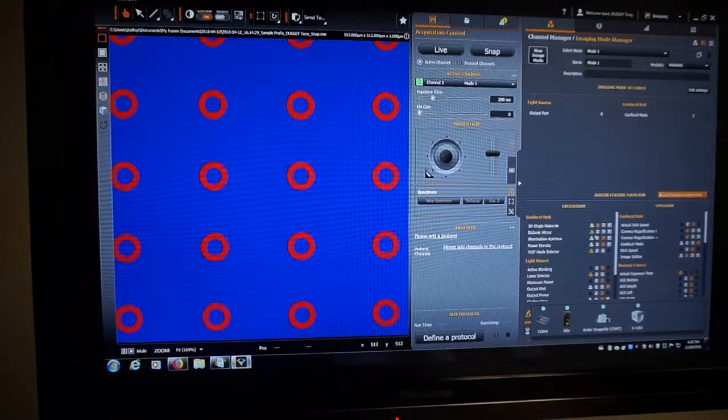In some ways that can be confusing because certain things should naturally be channel settings and certain things should naturally be global settings and certain things should be naturally advanced and imaging mode settings. So I would tend to just go with the default settings. The only thing I really change is the image splitter. I make the image splitter associated with the channel.